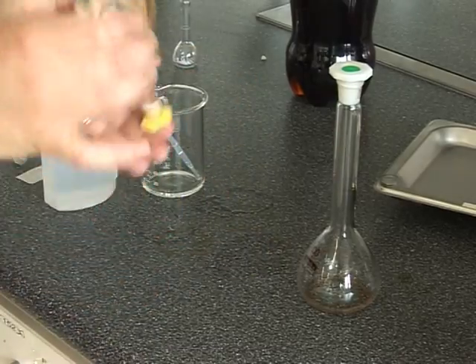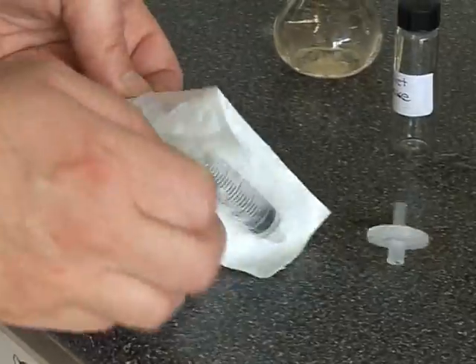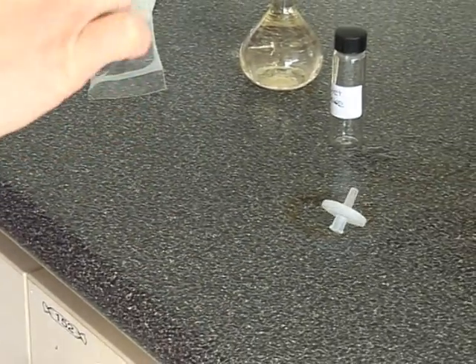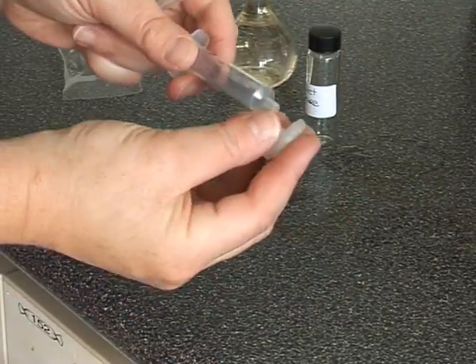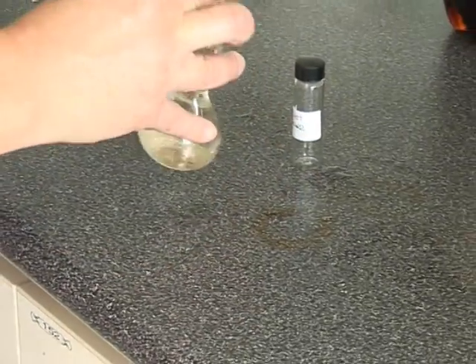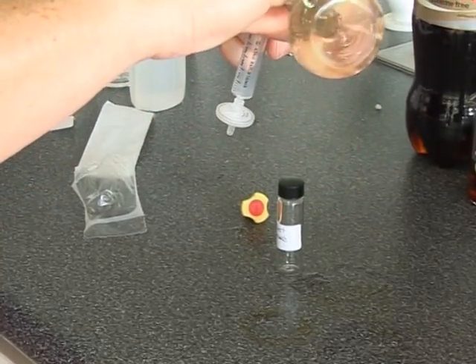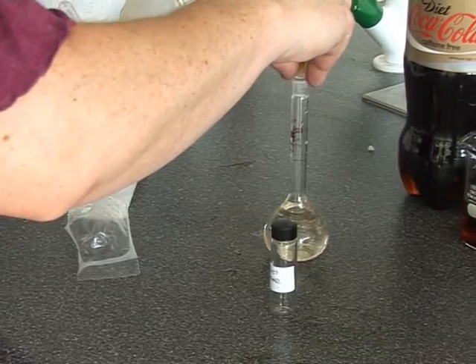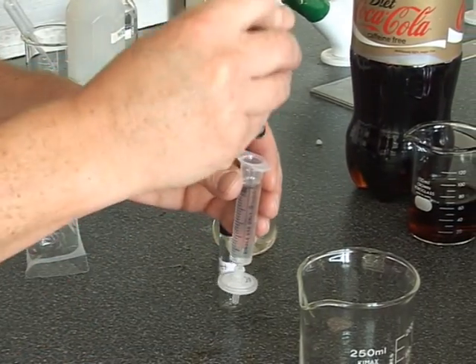Mix well. Prior to analysing the samples on the HPLC, you're required to filter the samples using a syringe and membrane. Remove the filter from the syringe and pull out the plunger. Replace the filter on the end of the syringe. Pour approximately 5 milliliters of the sample into the syringe. Replace the plunger into the syringe and push the plunger down slowly so that the sample passes through the membrane filter.